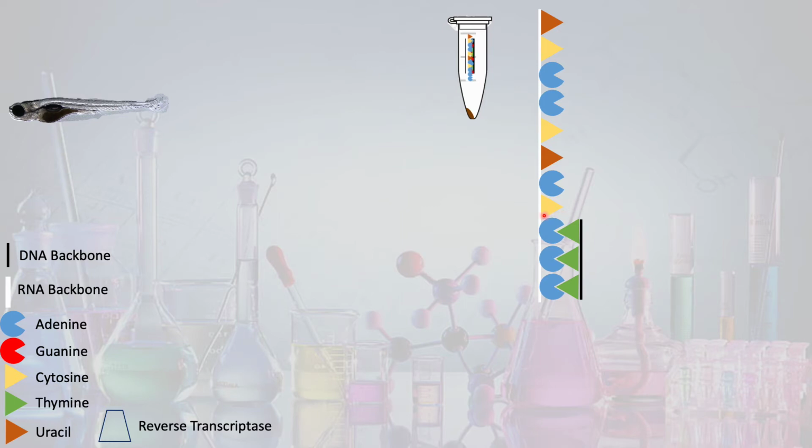So this is an artificial DNA sequence that's going to complement our poly A tail here, and this is going to link right up here and allow us to select for only our messenger RNA, right? Because our other types of RNA don't have our long poly A tail. So our oligo binds up here. We perform a quick cDNA synthesis, so it's a short chemical reaction using a thermocycler.